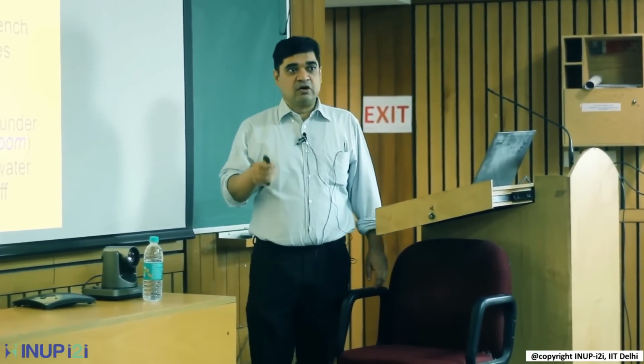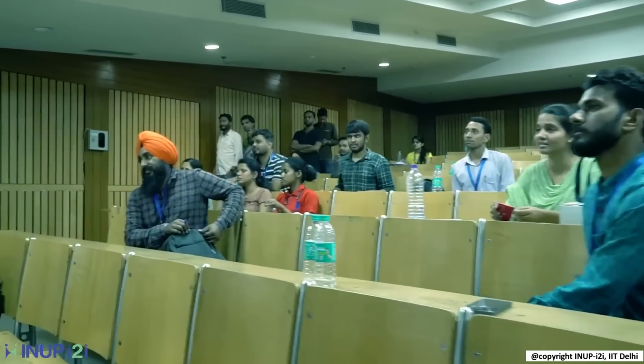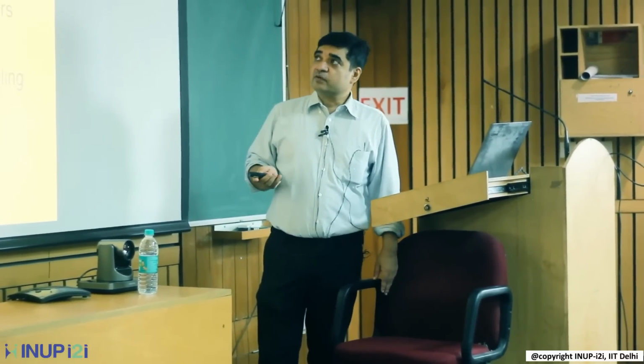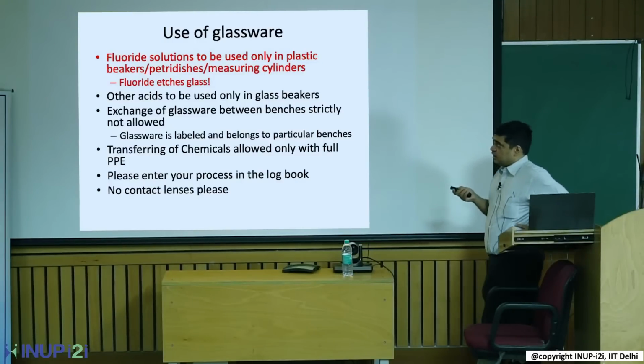It's going to seem a long time, but actually do it. And with all that water, you may feel like closing your eye, but don't, because that's a matter of your sight. After that you can seek help, this is your emergency step. So there are some rules and regulations.